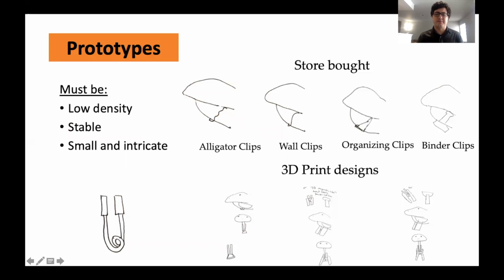Since we have 3D printing facilities on campus, we figured we would maybe try to make our own device. So we went through a couple of different designs. Initially, a lot of them were wrapped around the idea of popping the dewlap open with the fold and then pinning that fold open, therefore keeping the second ceratobranchials in a fixed, open position.